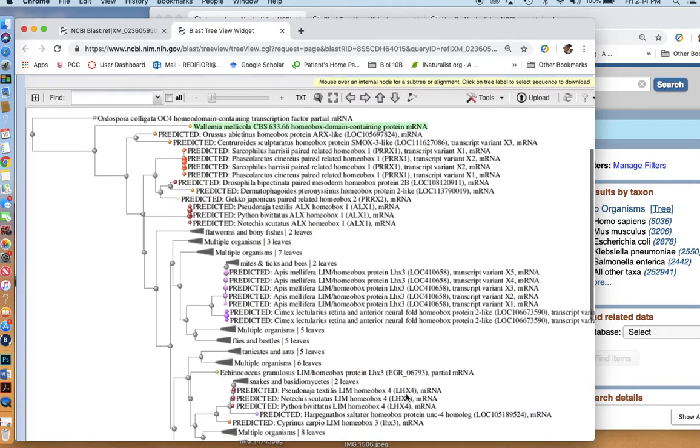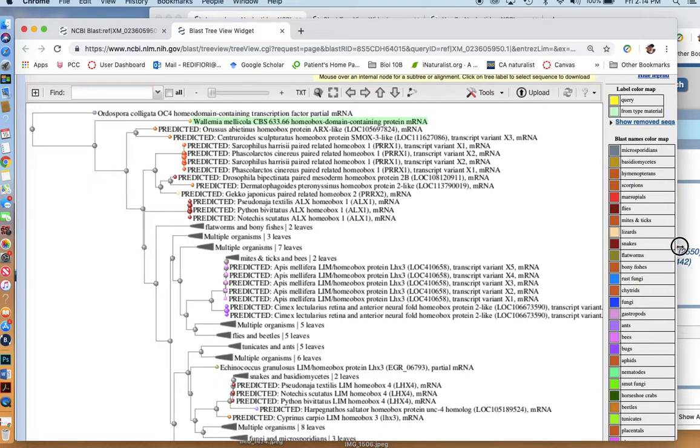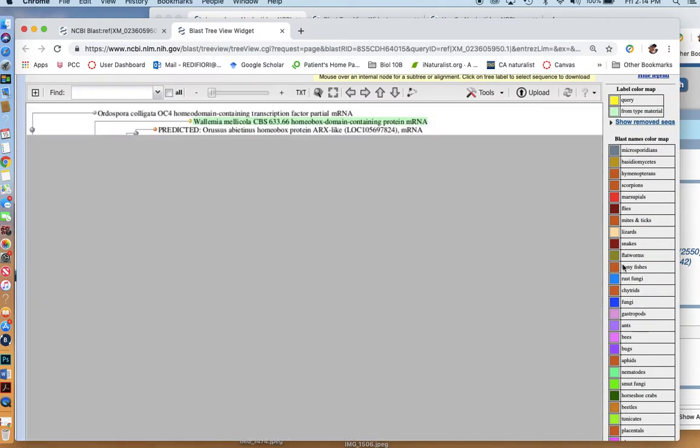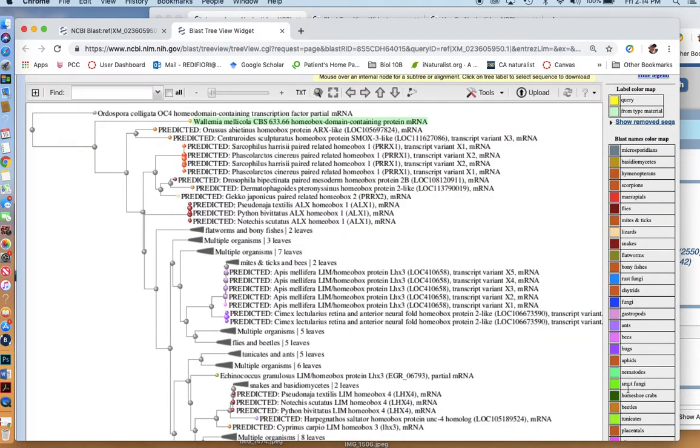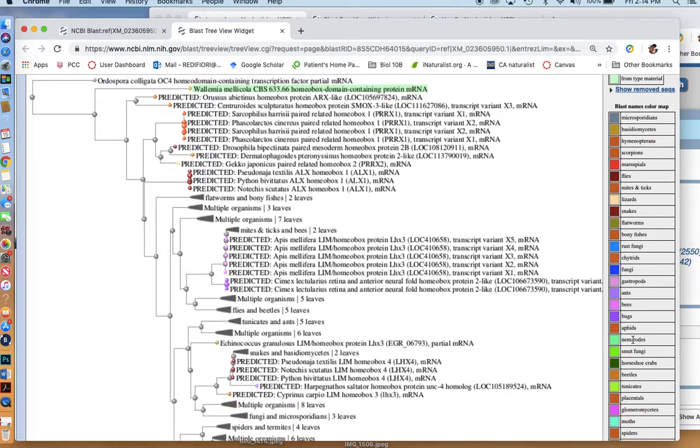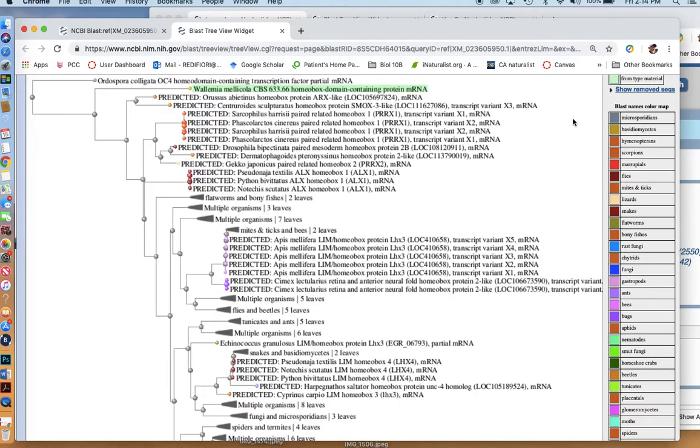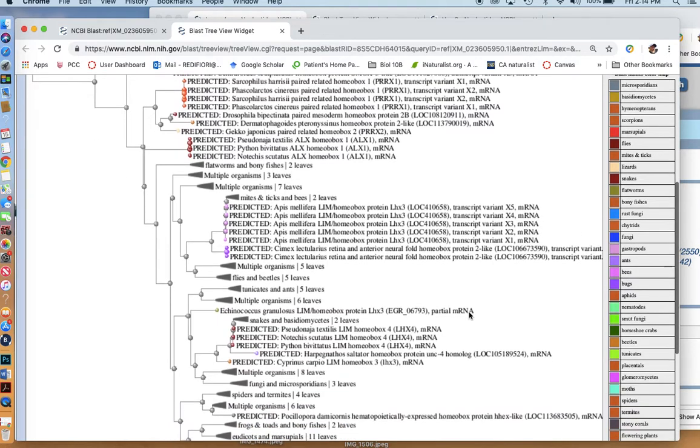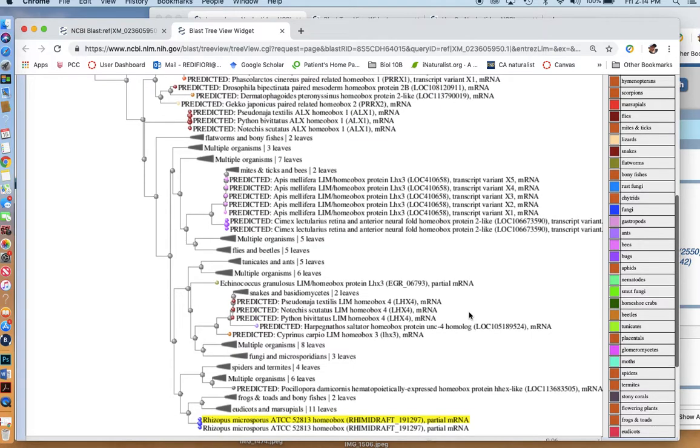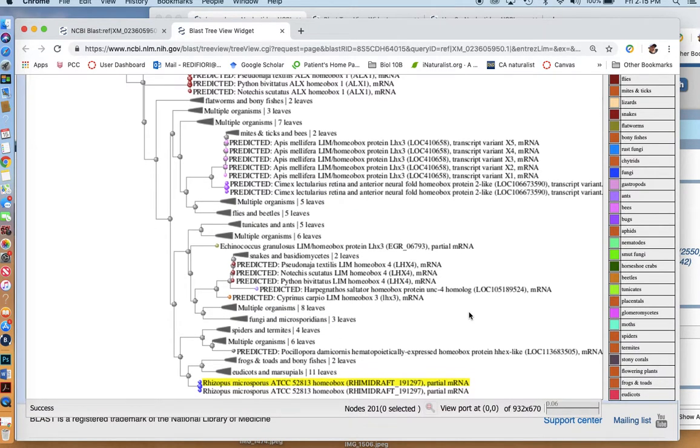And this will give us the quick phylogeny of this gene sequence. When I look through it, I find that there's a wide variety. If I expand this so that you can see the key to the taxonomic groups by color over here, and these little dots here relate to the colors you see on the far right. You'll notice there are all kinds of different animal groups, which is great. That means this is going to be a useful sequence for our exploration.